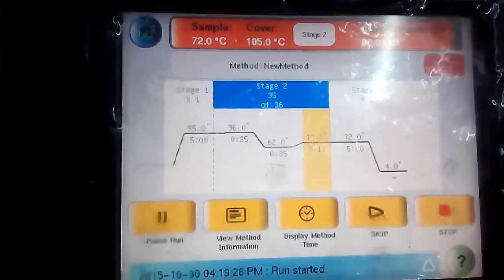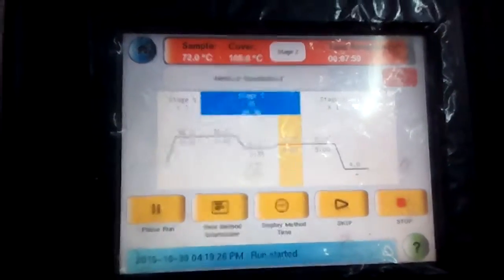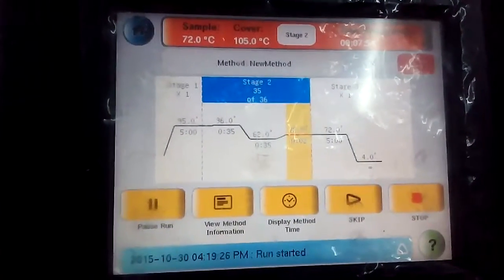This is the PCR touch screen showing stage 1, stage 2, and stage 3. These 3 stages constitute the PCR cycle.